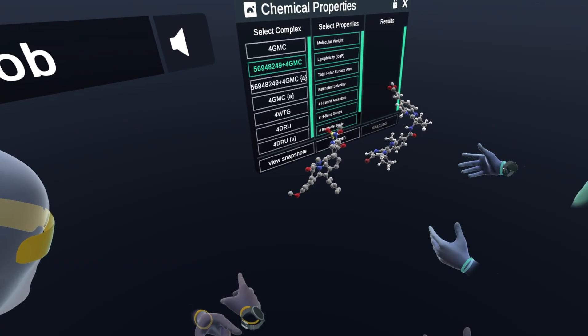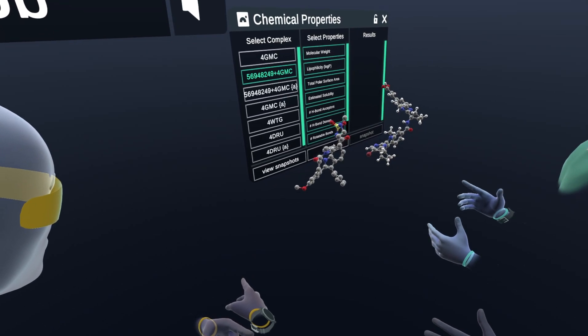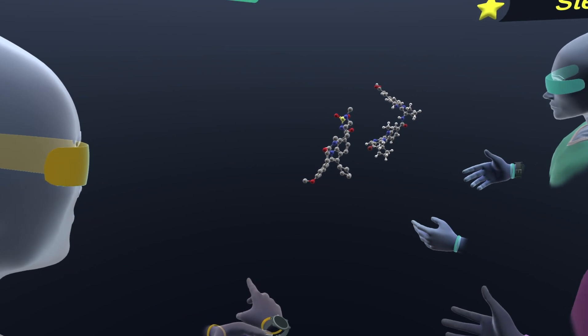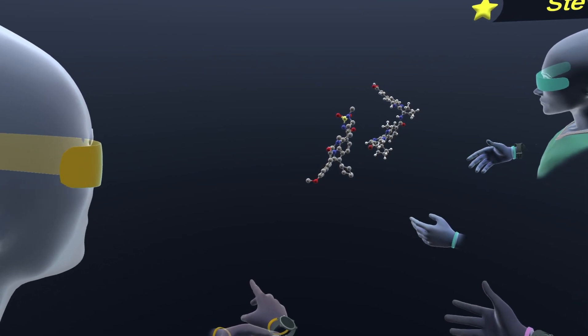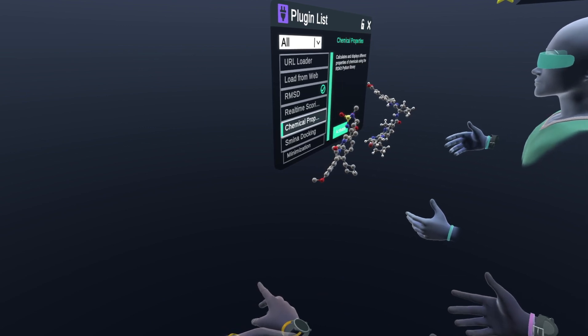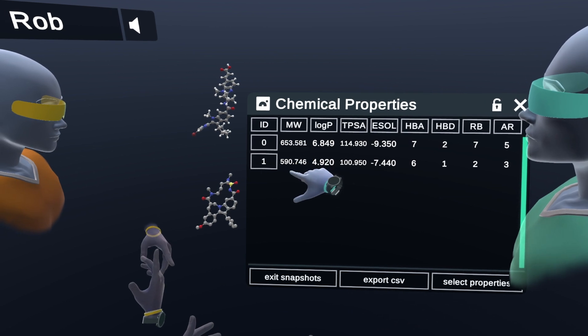This menu allows us to look at chemical properties. We can look at molecular weight, lipophilicity as log P, the total polar surface area. These are really important to chemists when they're making modifications to compounds, being able to compare from one compound to the other. The molecular weight is definitely higher on the Deliobuvir.